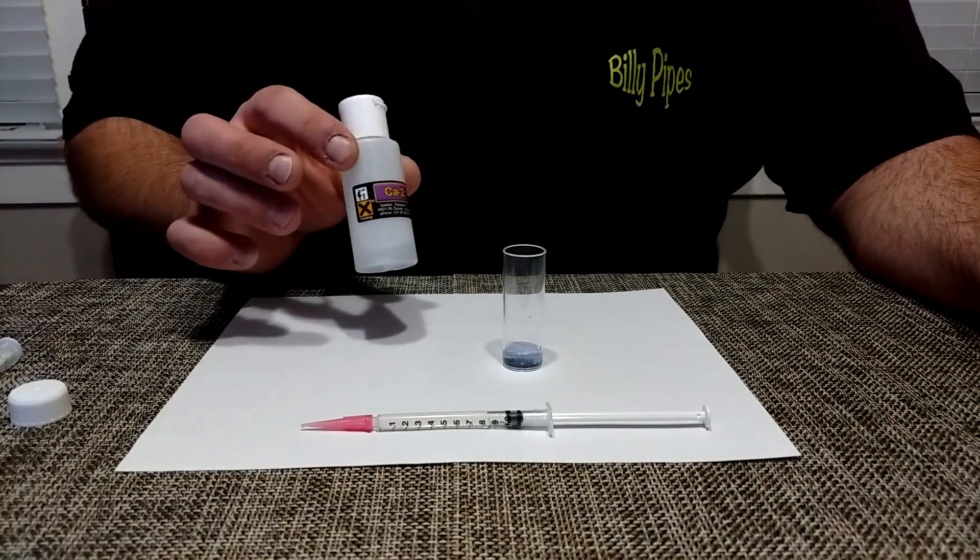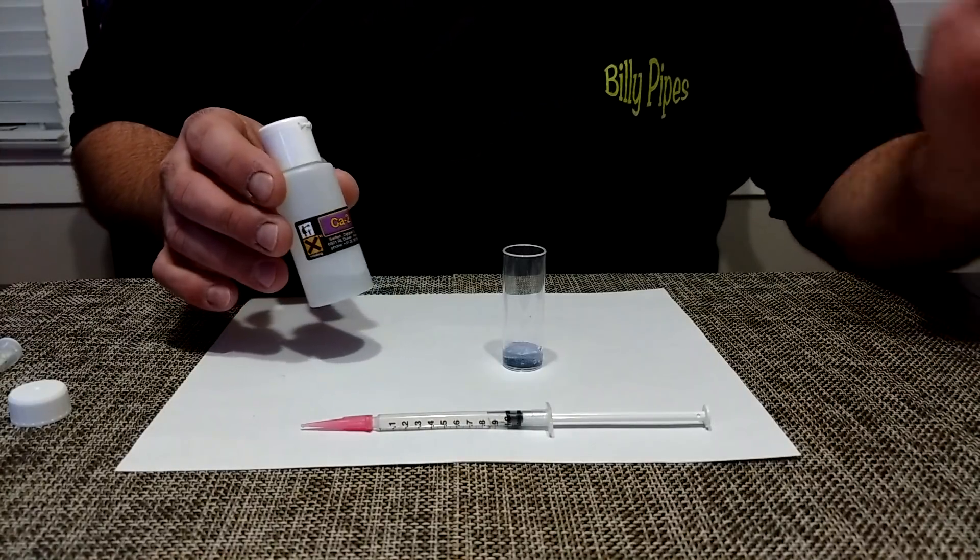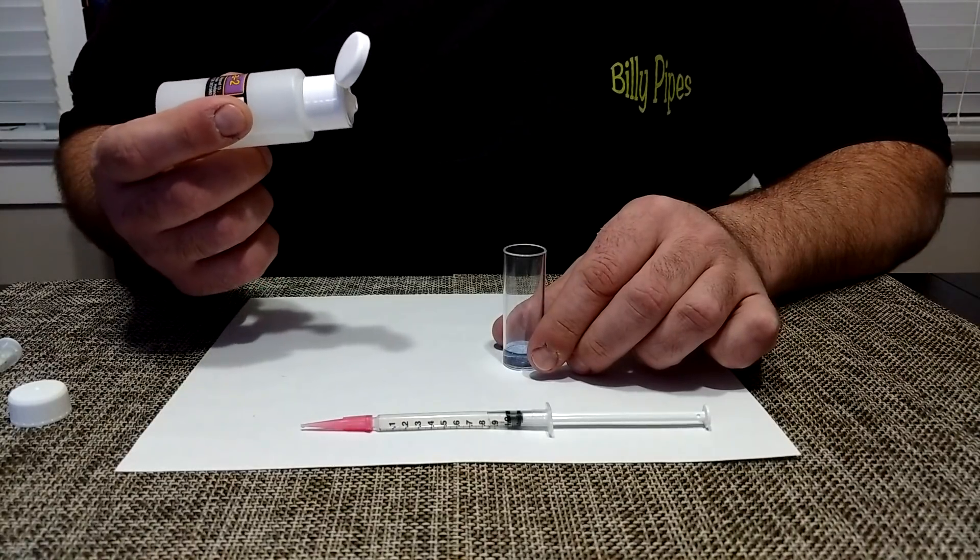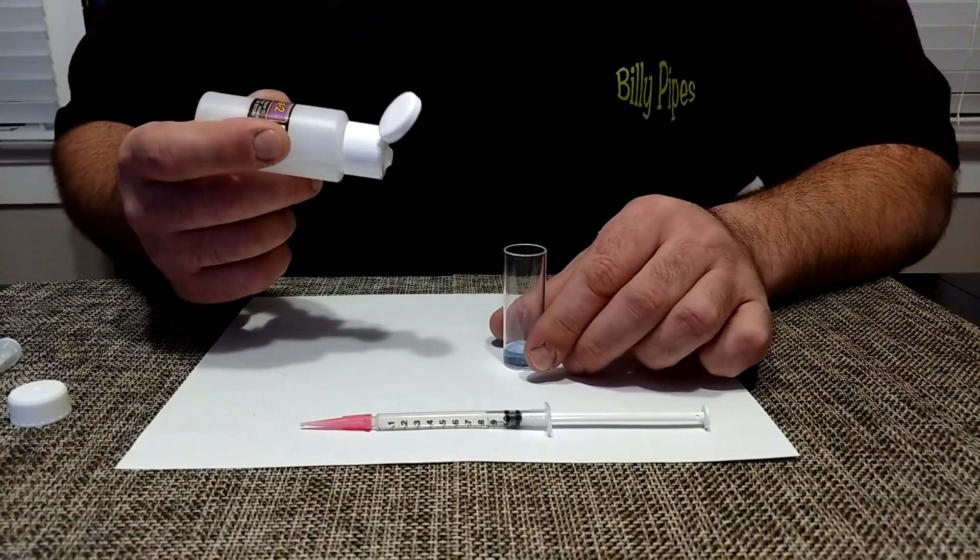Next step is to add eight drops of the CA-2. I like to spill out the first drop to get myself situated.